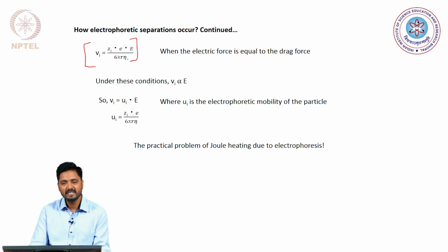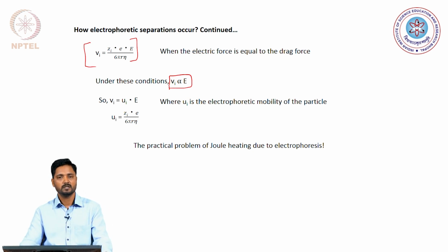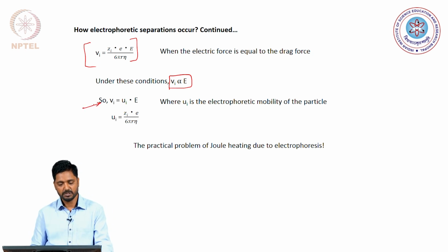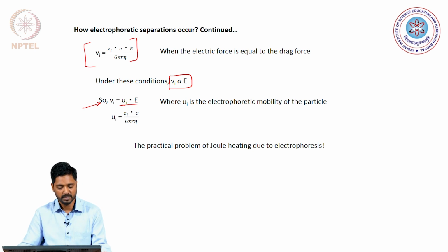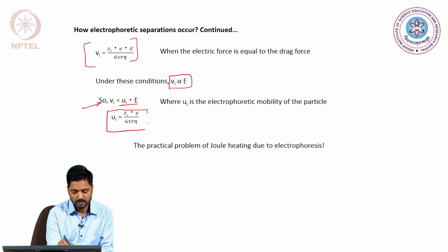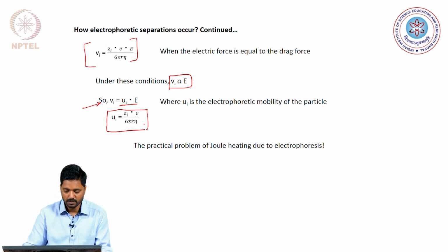Now, under these conditions, it has been found that the velocity of the particle is proportional to the electric field that is being applied, and this can be further written by this equation here, that is, the velocity of the particle is nothing but electrophoretic mobility into the electric field that is present in the medium, and the electrophoretic mobility hence is given by this particular equation, which takes into consideration the charge on the particle, the size of the particle, and the viscosity of the medium.